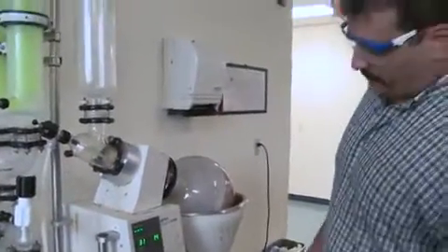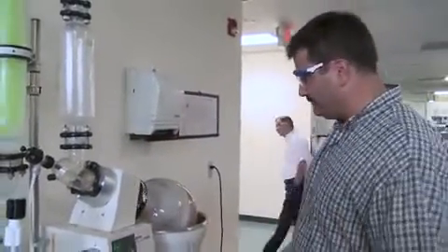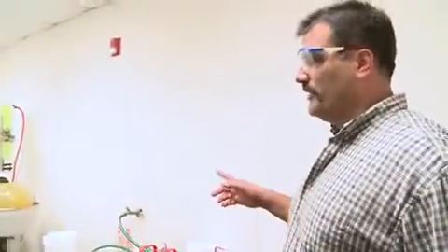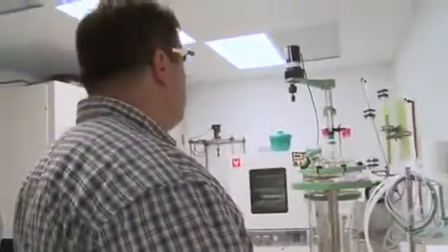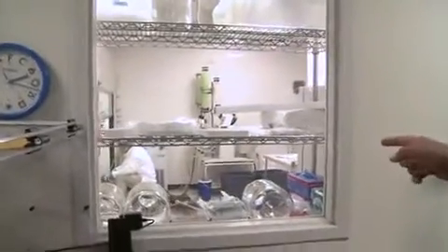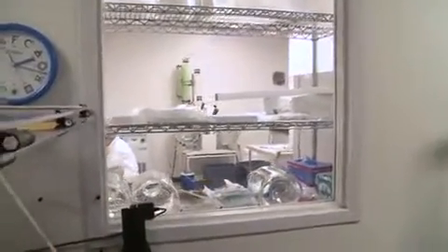This is, I think, our second oldest R220. This is one of our newer ones in an isolation area. Back here in the corner we have another R220, second of the three current Kilo Lab GMT rooms.